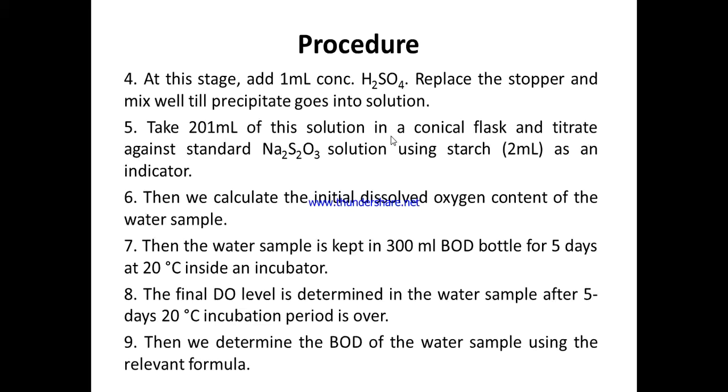हम क्या करेंगे, ये जो BOD बॉटल है जिसमें कंसनट्रेटेड H2SO4 ऐड कर दिया गया है वहाँ से हम 100 से 150, 100 to 150 और sometimes we add 201 milliliter of the bottle to be precise in a flask and we add starch as indicator.